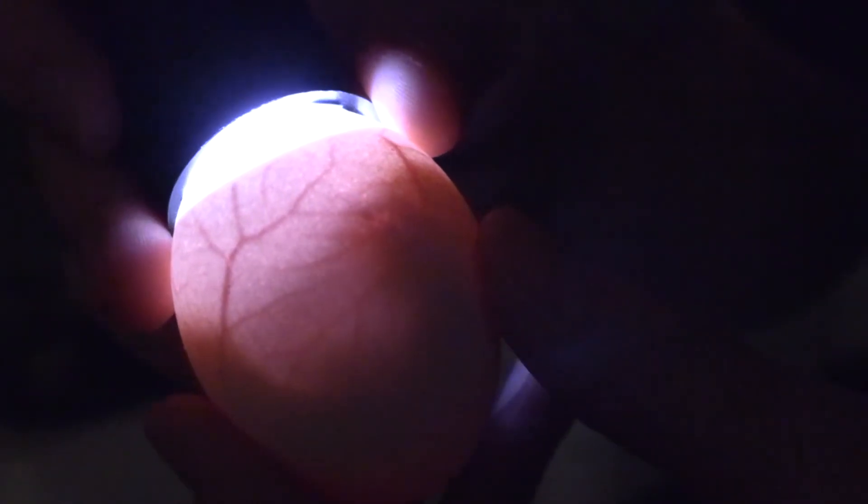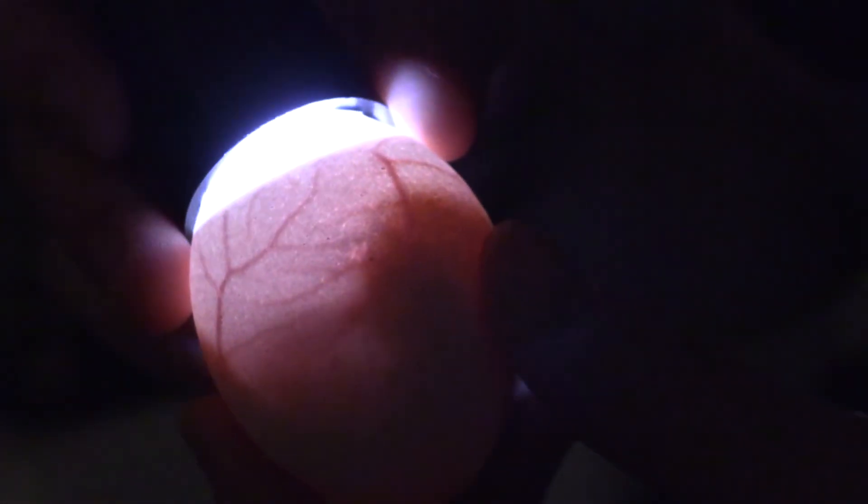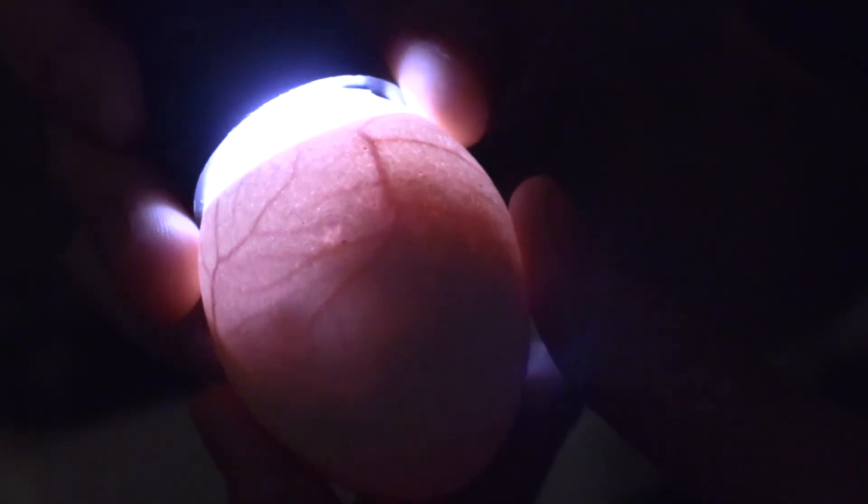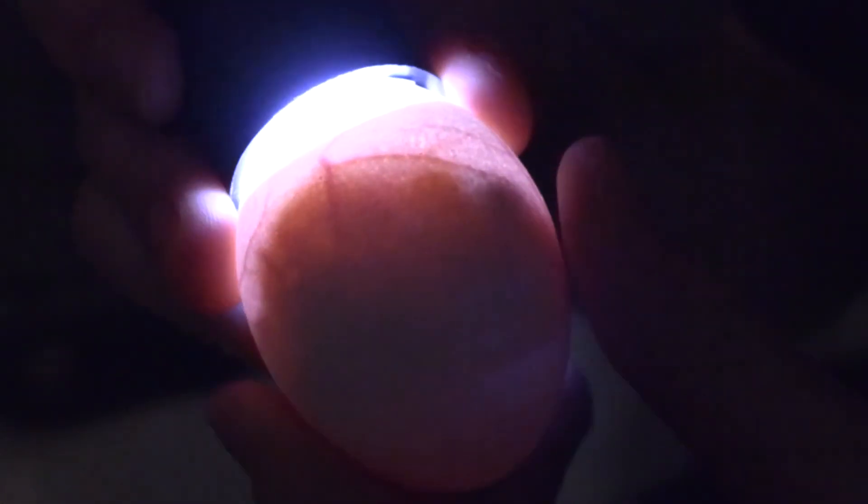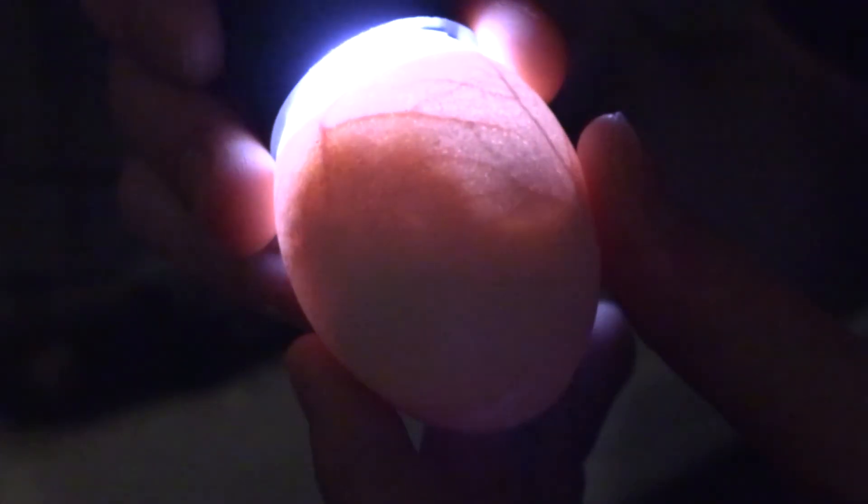At this stage of development we will never find a yolker in our incubator because they have been culled or removed from our incubator when we did day 7 of candling. You can see the eye as I rotated a little bit there.